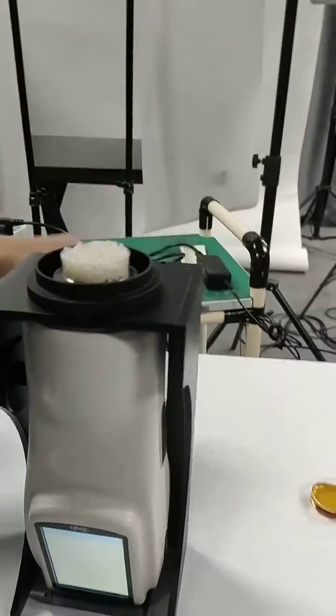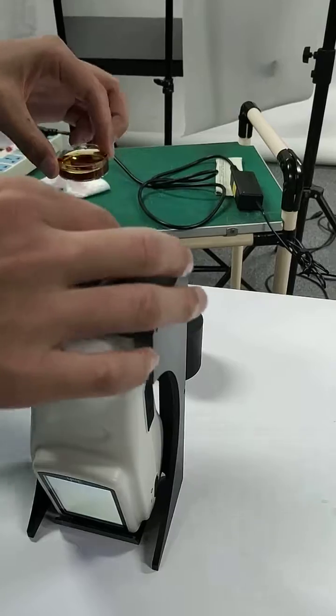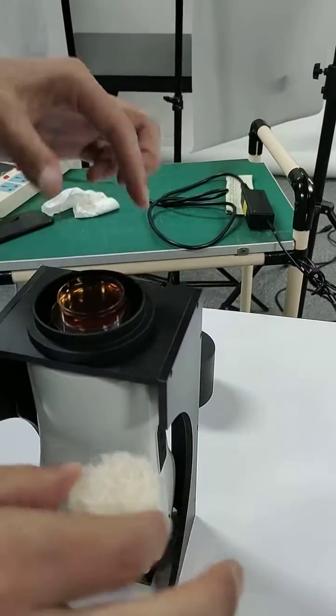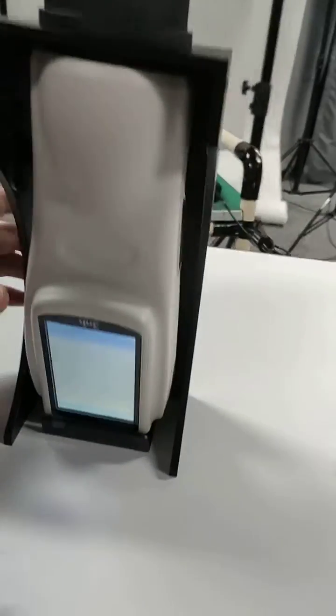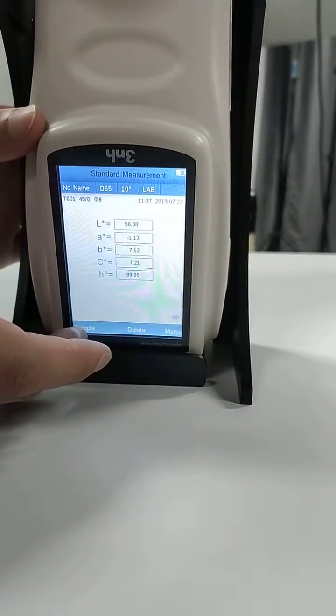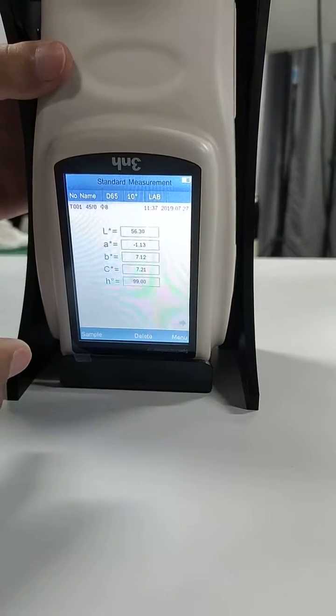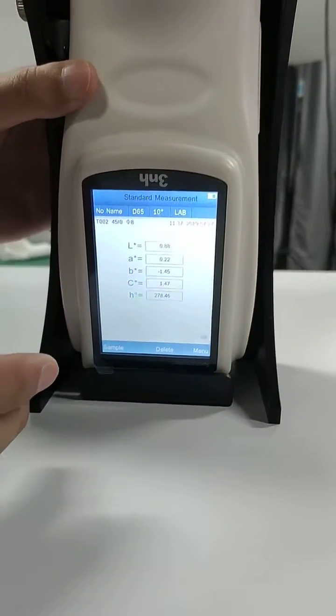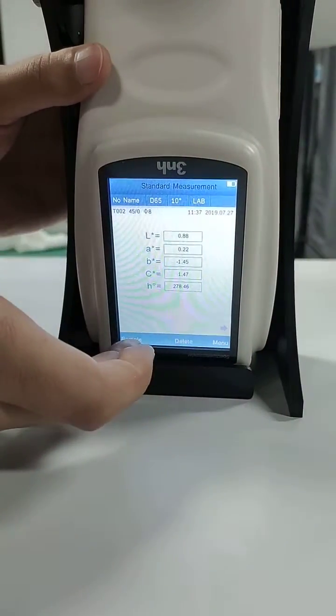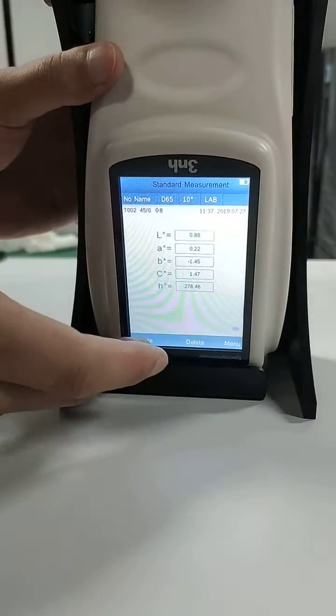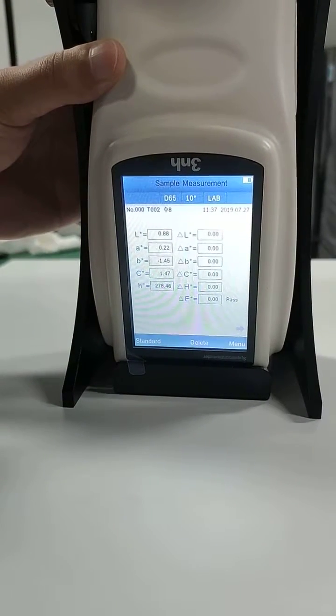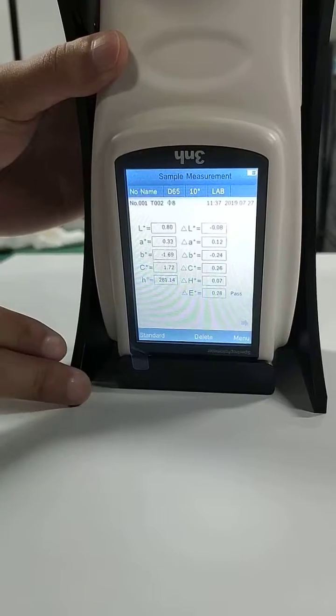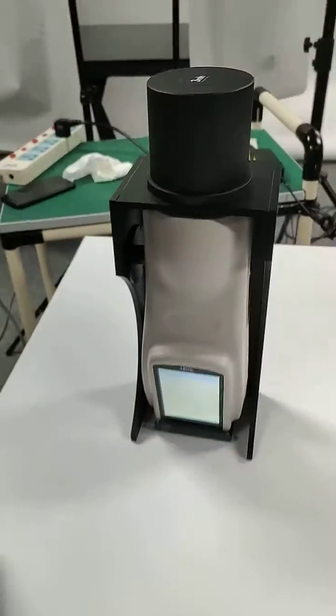To measure the liquid, it's all the same. Cover. Standard measurement. Press a button. Okay. This is a measurement result. Okay.